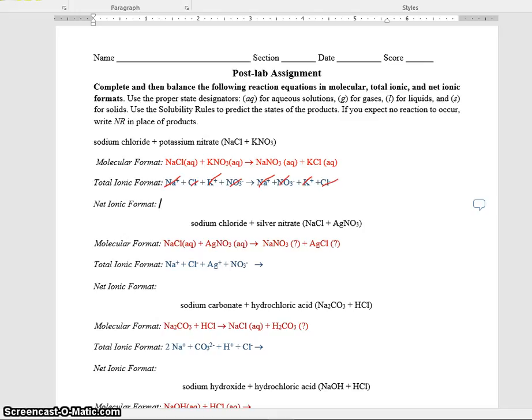So what we're going to do here is write an NR. So that's all we have to do. All right, let's look at the next one.